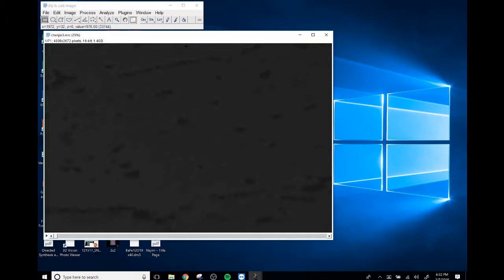And there we go. So this is our raw data. There are two things that probably pop out to you. The first is that it's very, very dark. The second one, which might not pop out to you because of how dark it is, is the fact that the particle is misaligned. There's a lot of hopping and jumping around. If I wanted to use any one of these particles for the 3D reconstruction, it would look like a mess. We need to realign the tilt axis so that the particle doesn't move in the X and Y.